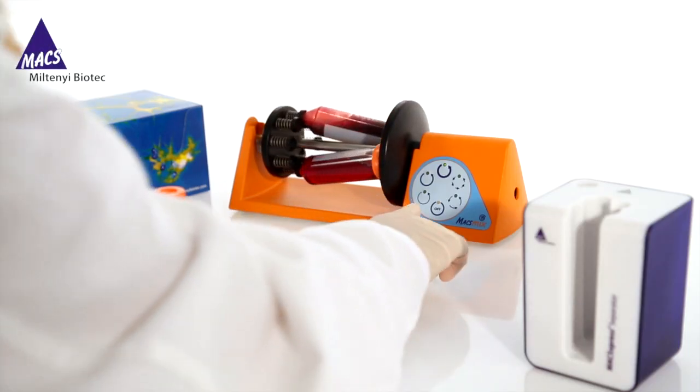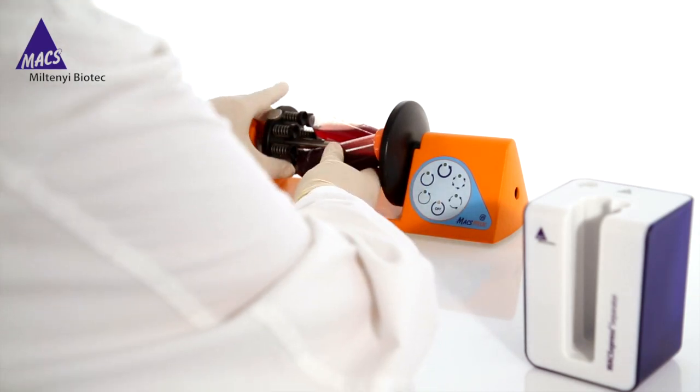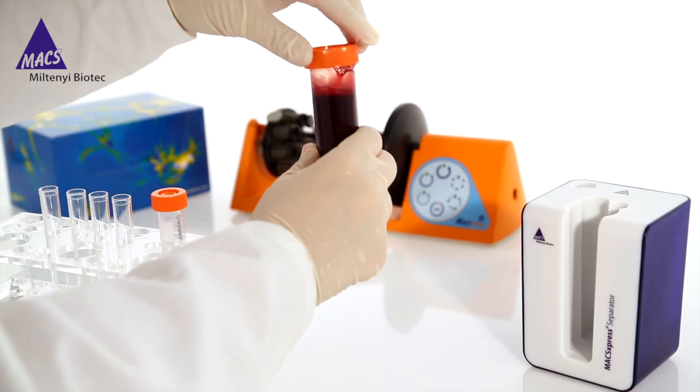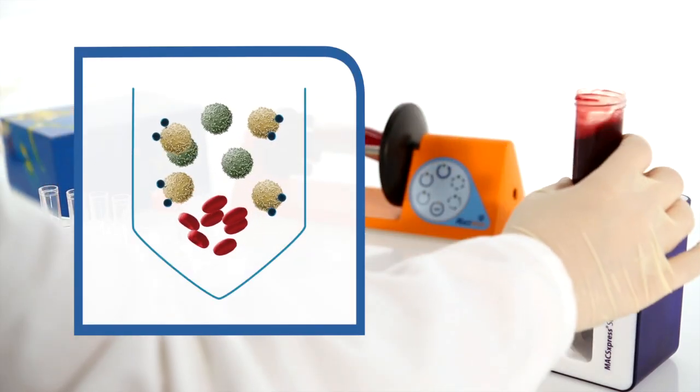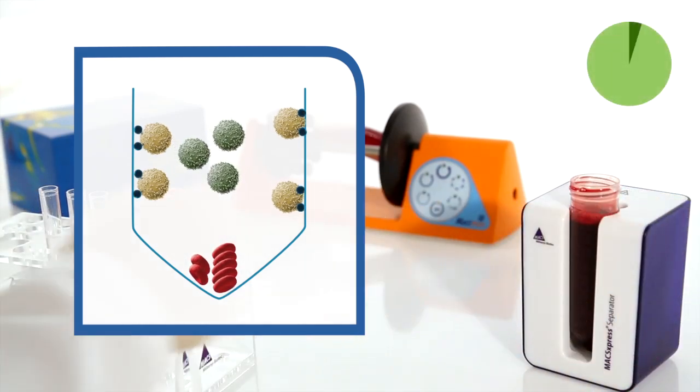To isolate the target cells, place the tube in the magnetic field of the MaxExpress separator for 15 minutes. Erythrocytes will aggregate and form a sediment. The unwanted cells, which are magnetically labeled, are drawn to the side of the tube, whereas the target cells will remain in the supernatant.